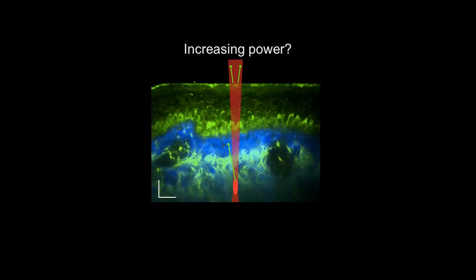What Professor Gratton and his group are doing is that they detect the fluorescence in transmission, by having a huge detector down here that is able to capture all the scatter that we miss when we collect with the same objective. It collects every single fluorescent photon that is transmitted through the tissue, so your signal generation is higher, and you can generate images very deep.